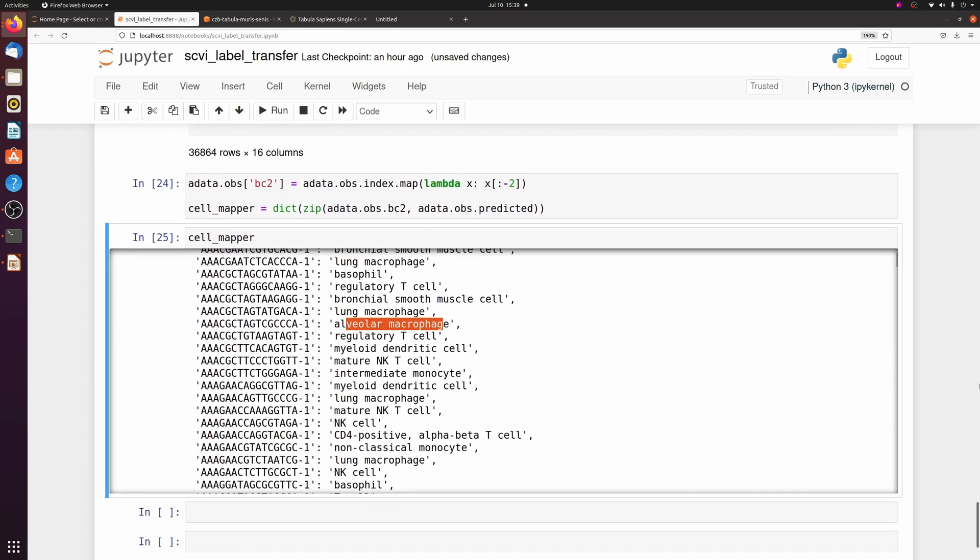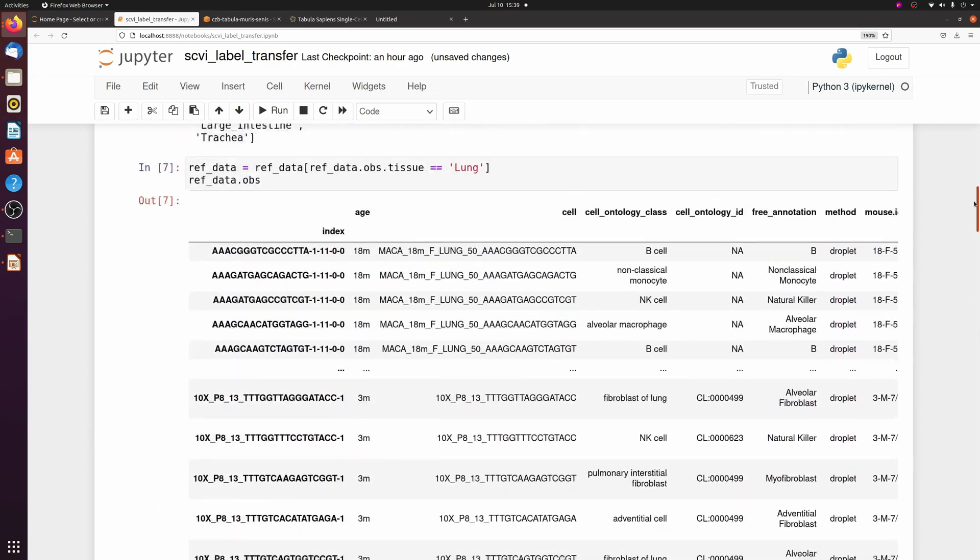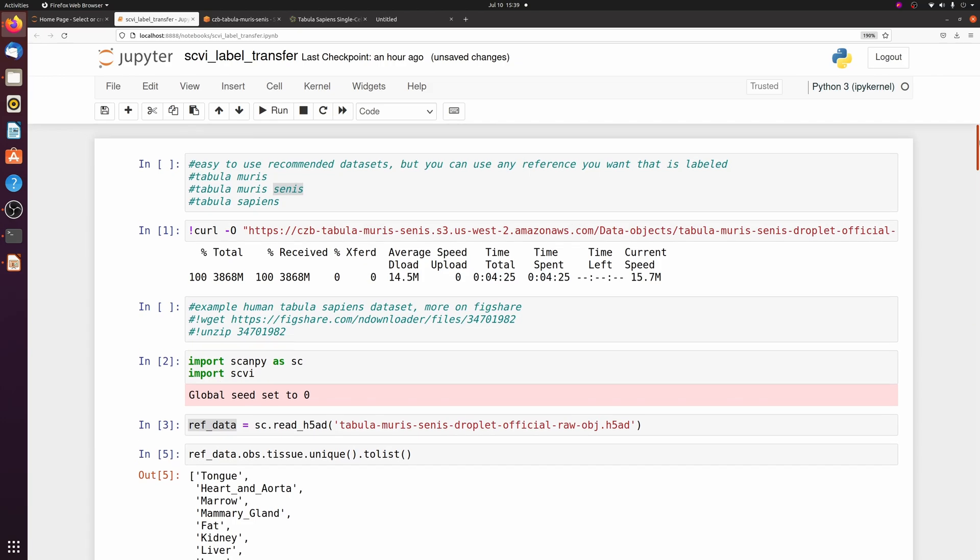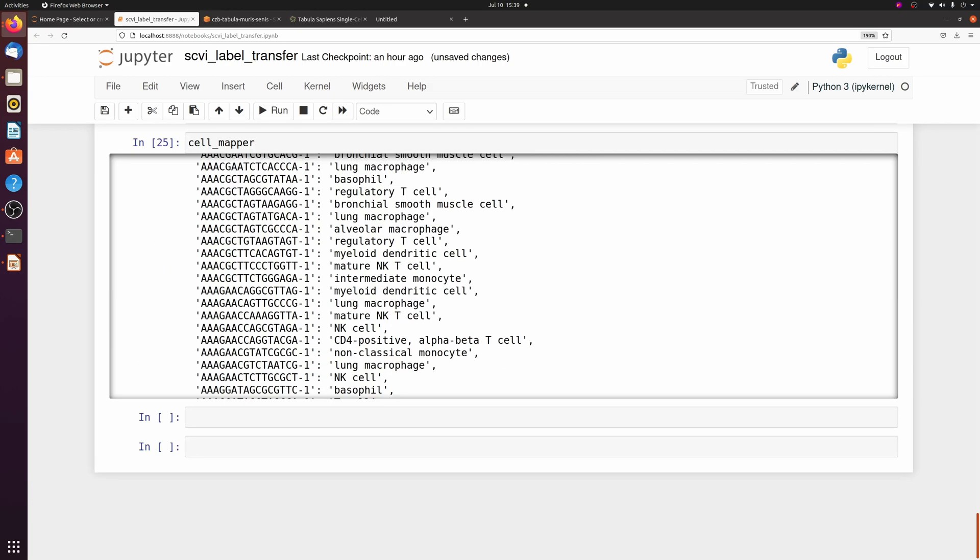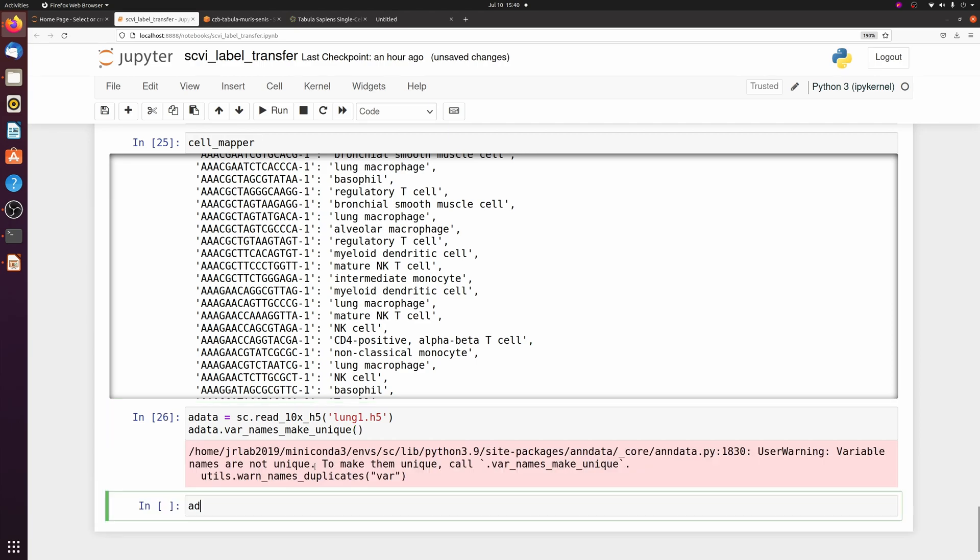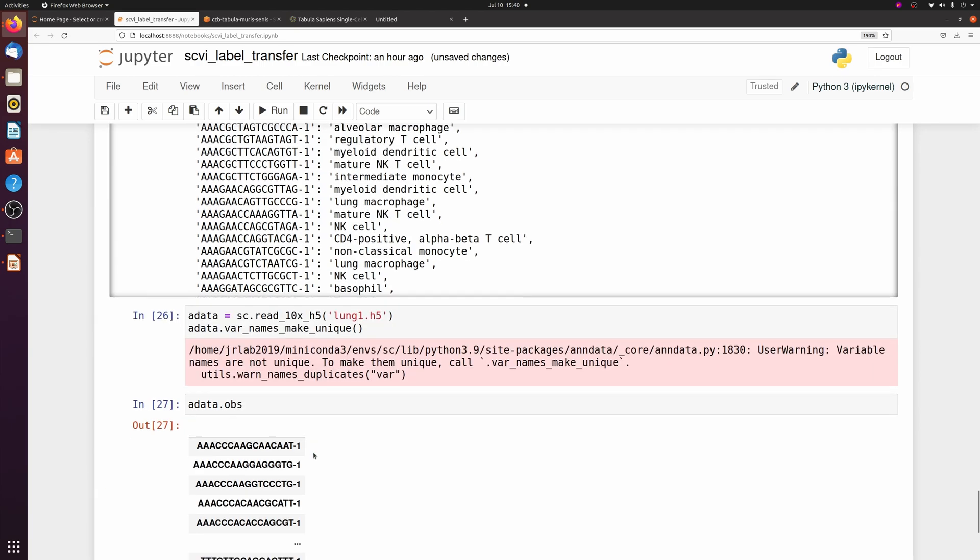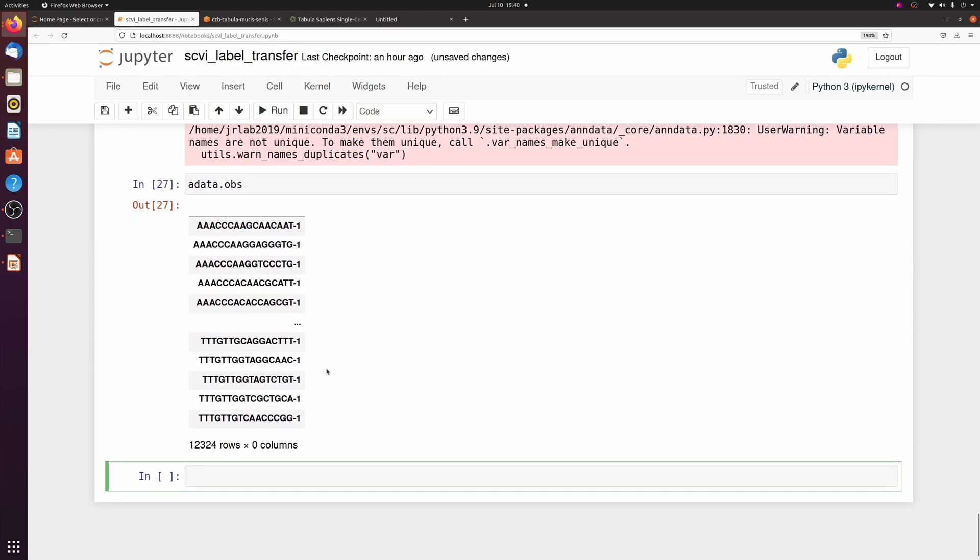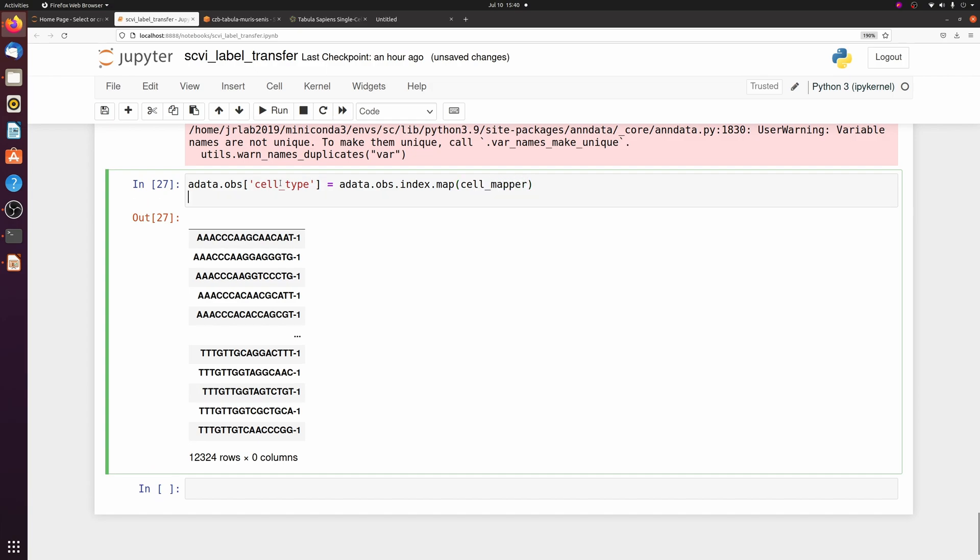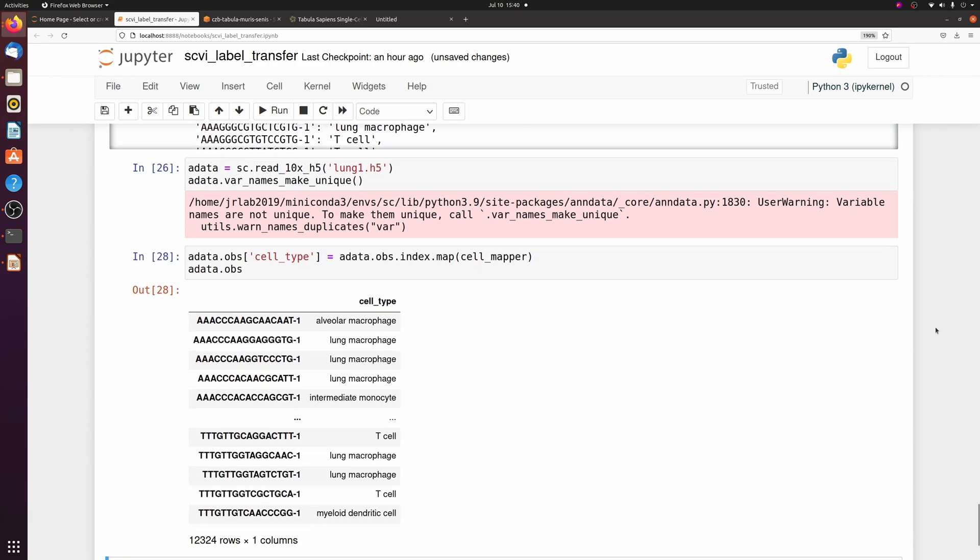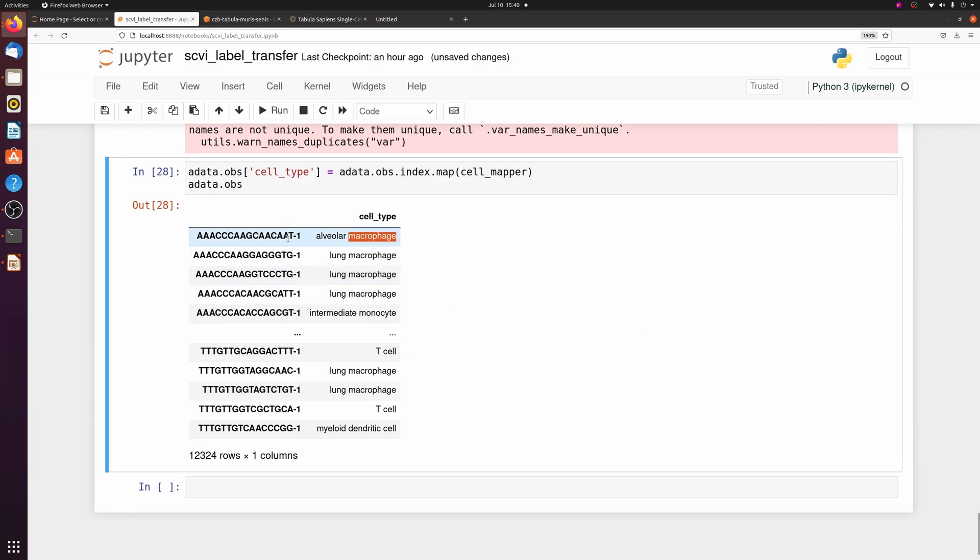So now we have this dictionary of cell barcodes and cell types. What I'm going to do is I'm just going to reload my adata. Then if we look at it, obviously we have no observation data. So let's make a new column, call it whatever you want. I'm going to call it cell type, and it's going to be adata.obs, and then I'm going to map the index column, which is the barcodes, to that cell mapper dictionary we just made. And now you see we have a cell type for every barcode.